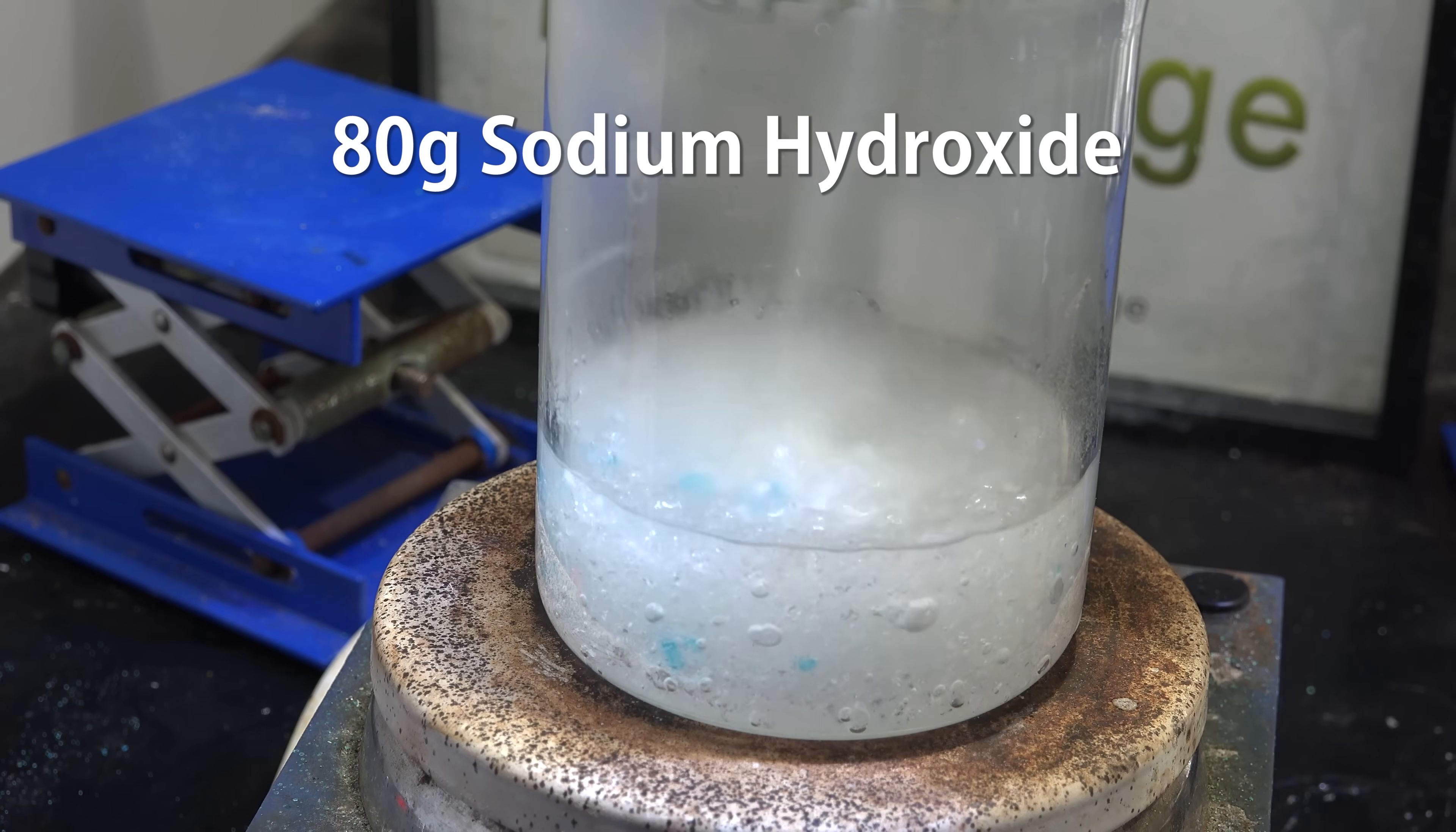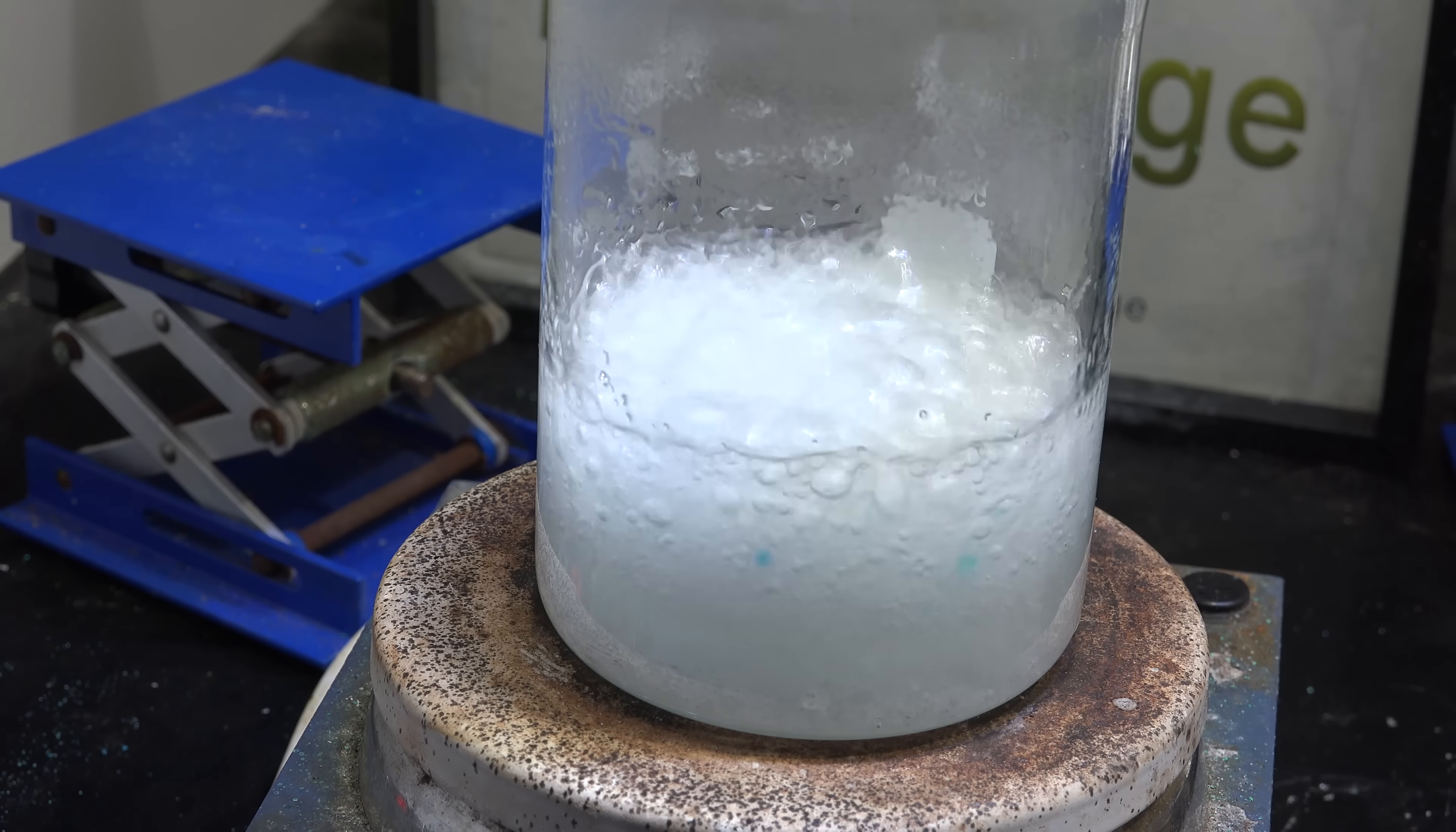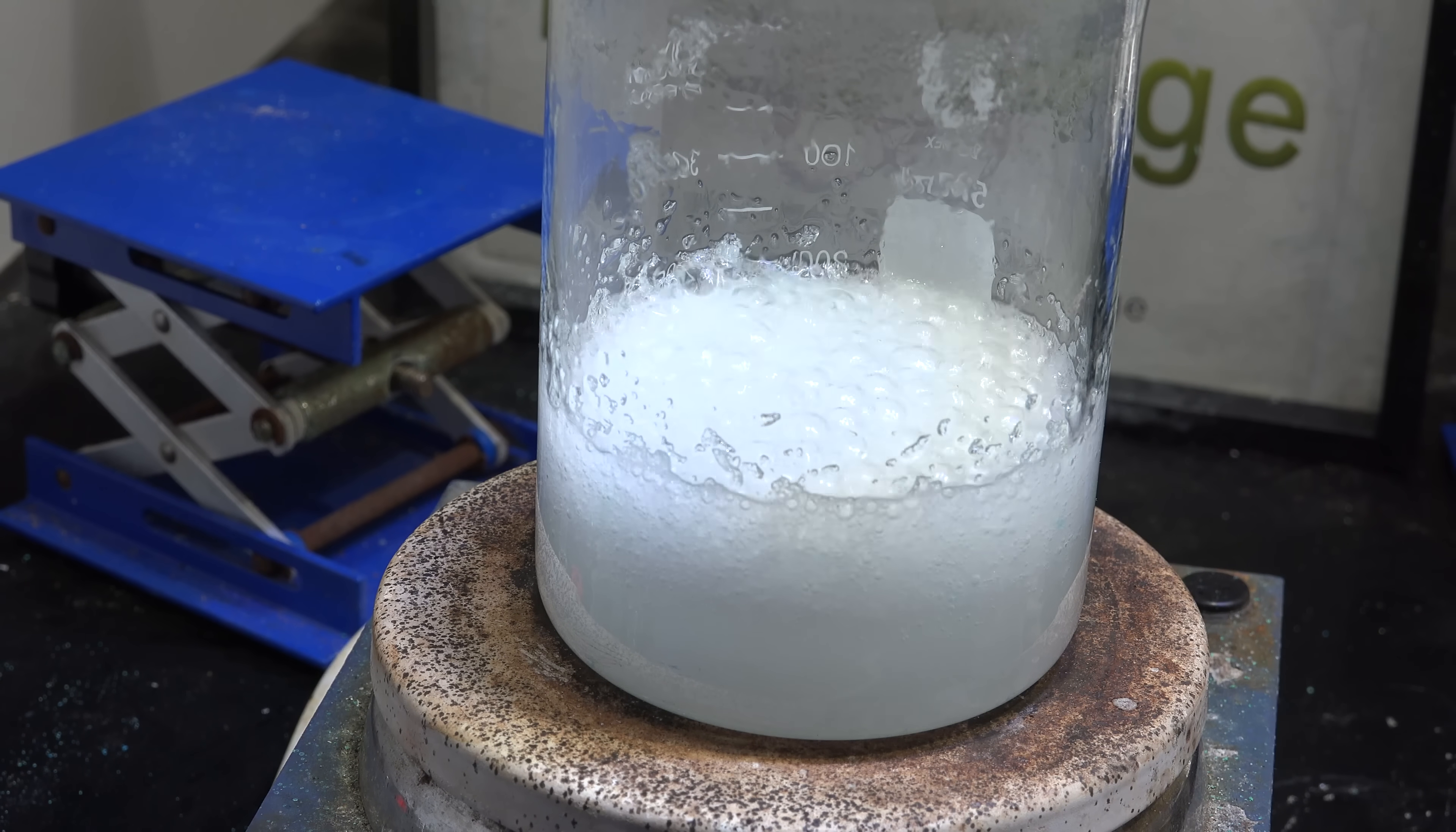Now with stirring, add 80 grams of sodium hydroxide in small portions. Don't add it all at once or it will boil out of control from the self-heating. I got my sodium hydroxide from drain opener.